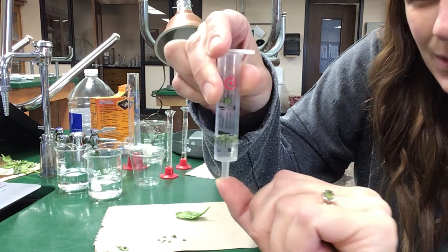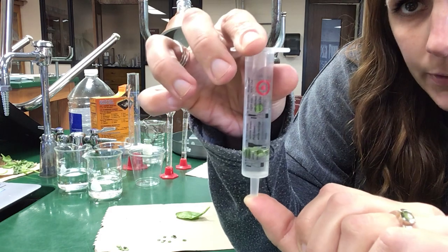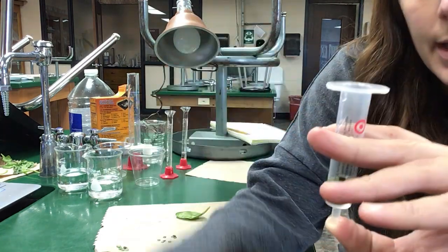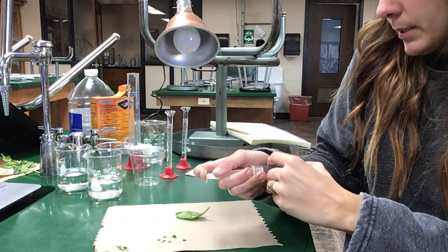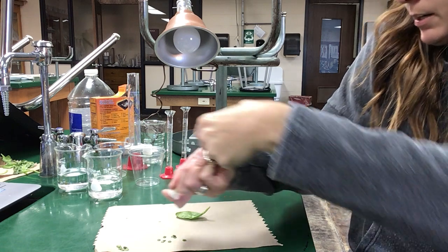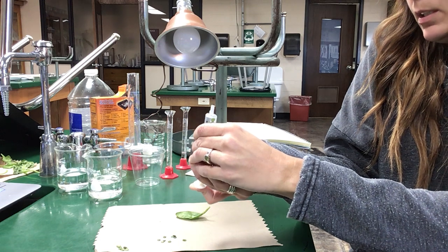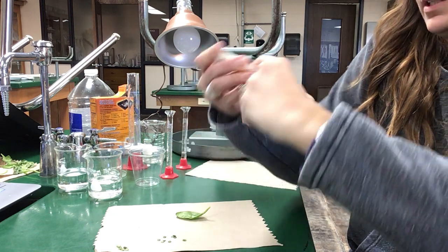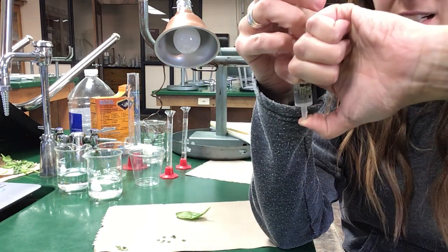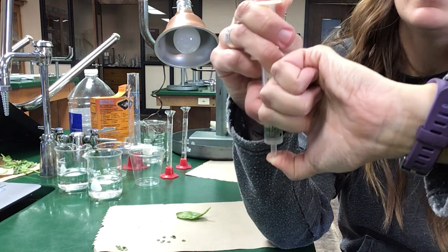So if you can see this, where's the camera? These leaf discs are floating right now. I'm gonna make them sink, and the way I do that is adding this plunger and creating a vacuum. So we're gonna put this plunger in, get all the air out, and then create a vacuum. I know you're not gonna be able to see this super well. I'm gonna swirl this so that these leaf discs eventually get that bicarbonate solution in there.